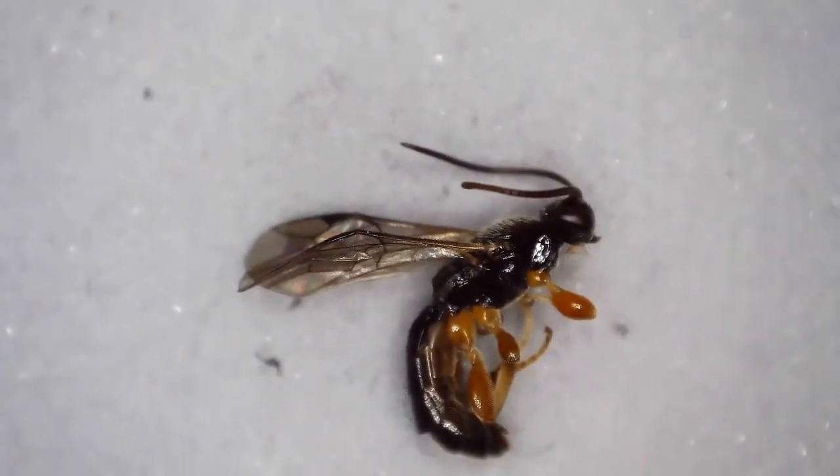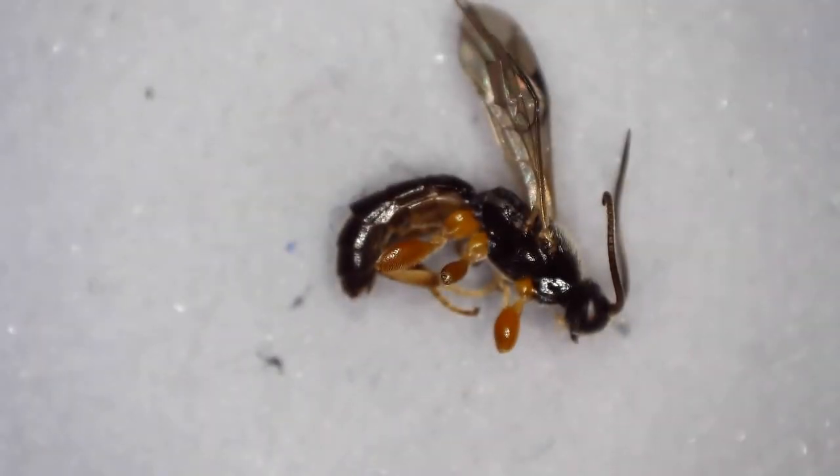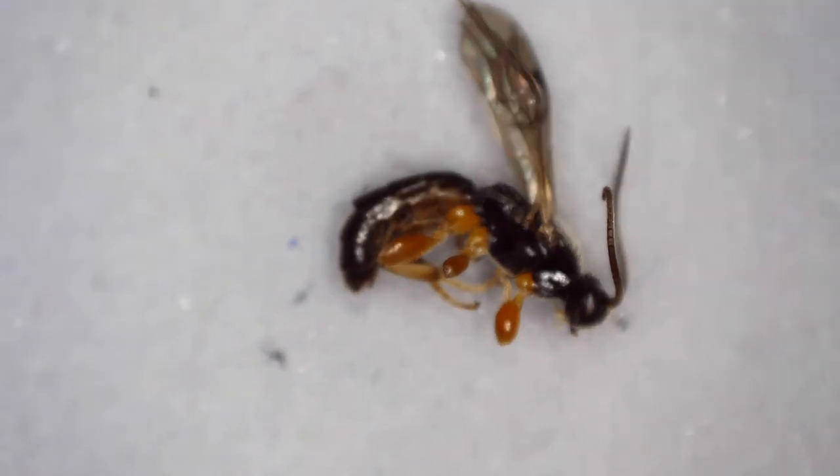So every other video up until this point has been sped up around 300 times the actual speed. But for this point mounting segment, I'm going to slow it down, or rather play it, at the actual real-time speed. So there's my point that you just saw go by. And now I'm going to bend that point down to give it a little bit of a shelf. And there is that shelf right there.